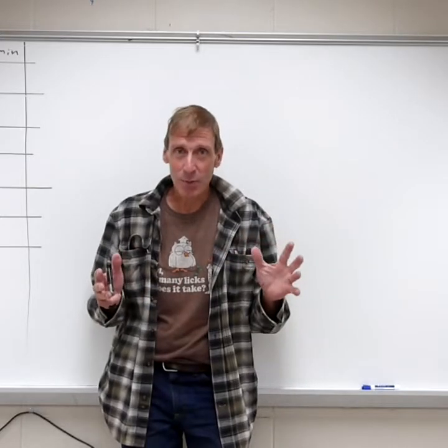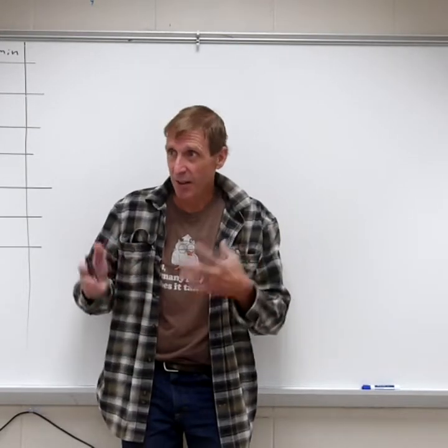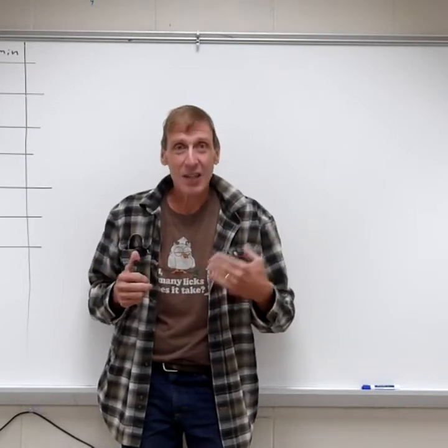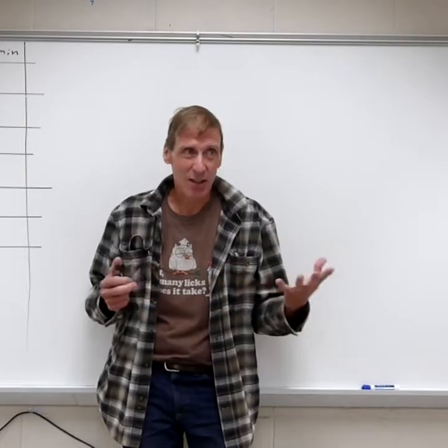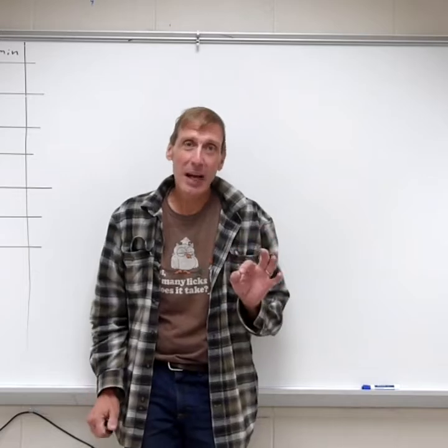So I'm about to go through the procedure. Really, there's not going to be that much for you guys to do. Once I've done this video and gone through the procedure, you're just going to have to make me like 3 figures, graphs. That's all you're turning in. So it's really not too bad. Again, this is a metabolism lab.